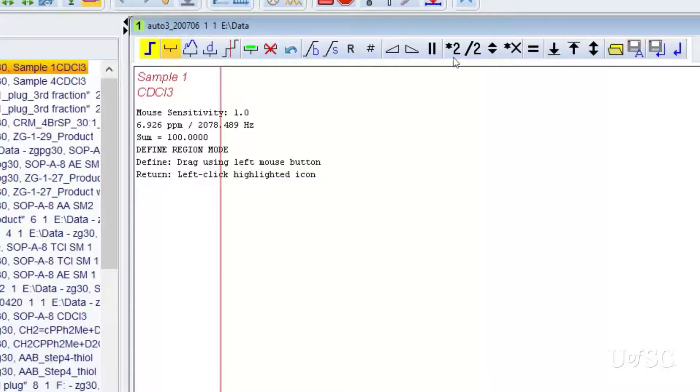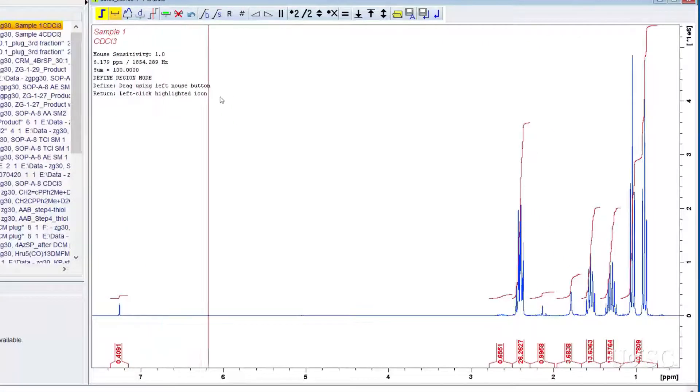Our manual has a full description but we will work with a few here. When you start with manual integration you have a choice to edit the integrals produced by ABS, or remove the current integral regions and start from scratch. The decision depends on the extent of the edits required.